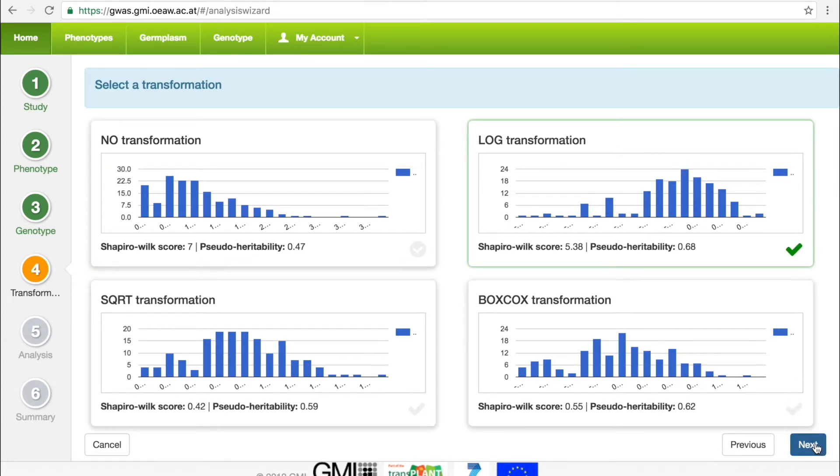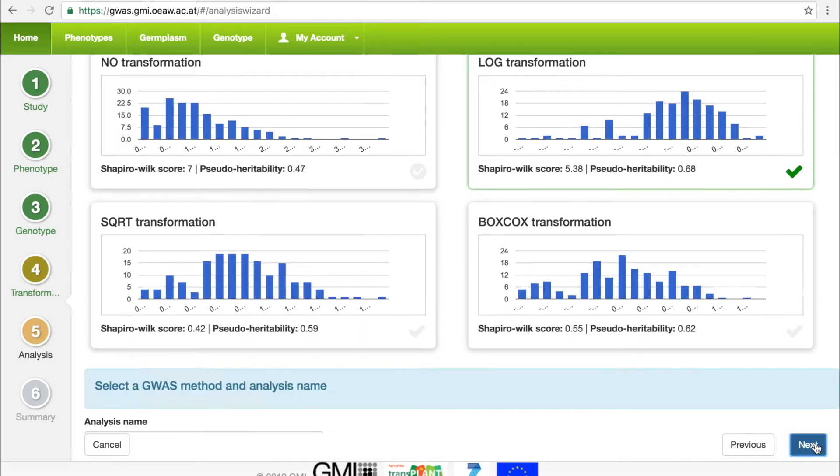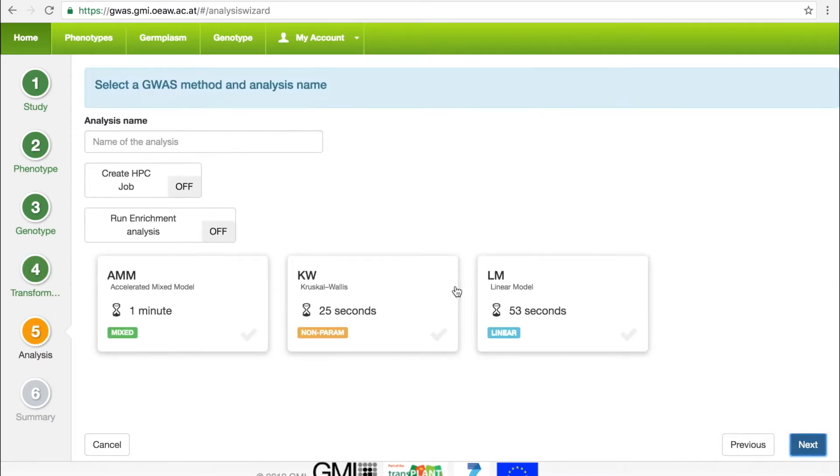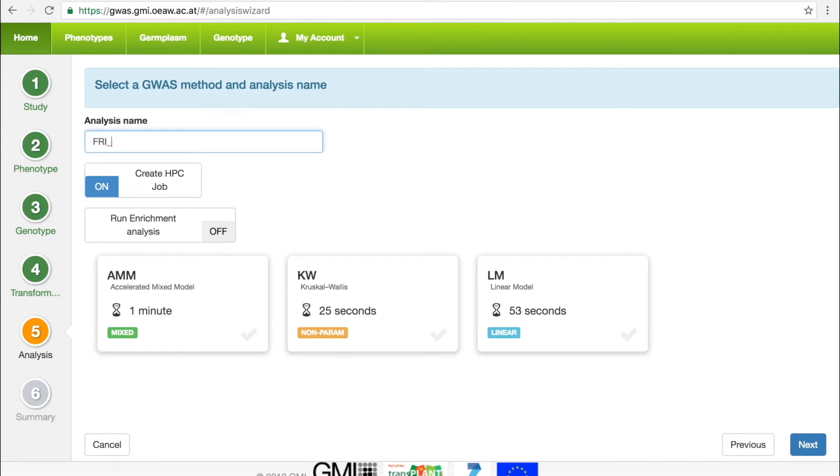In step 5, the user can choose to run the job on our cluster, and must provide a name for the analysis before choosing the type. The GWAS Portal provides three methods: AMM, a linear mixed model that accounts for population structure, KW, a nonparametric test, and a linear model, LM.